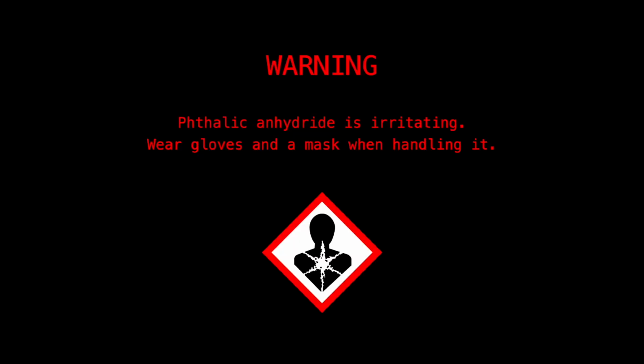Warning: phthalic anhydride is irritating. Wear gloves and a mask when handling it.